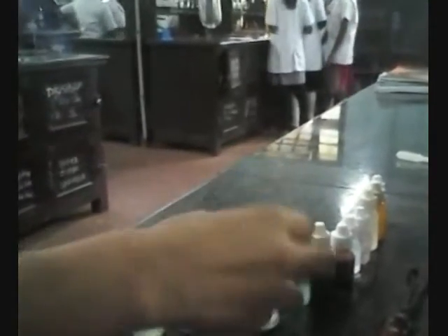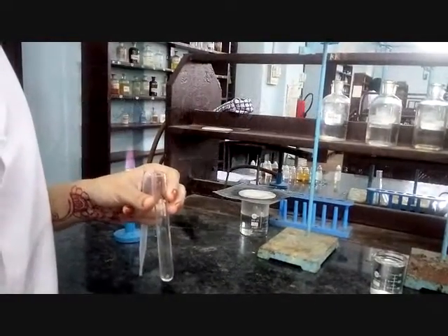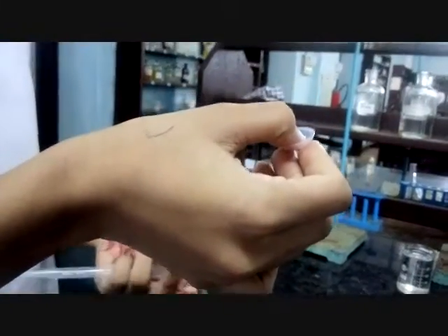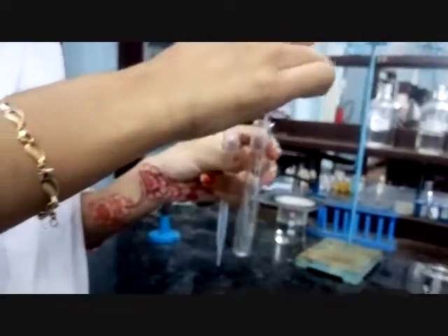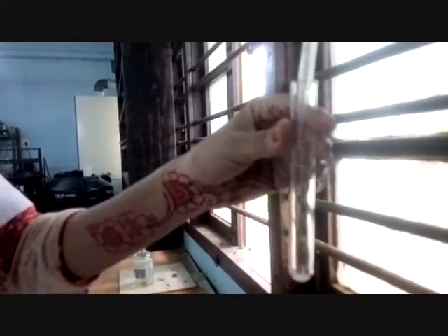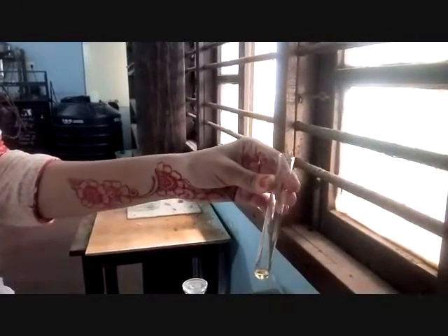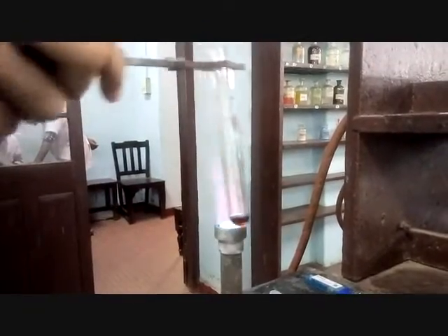Confirmatory test for carbohydrate. Action with concentrated H2SO4. Take a little of the compound in a test tube and add concentrated H2SO4, and warm it.